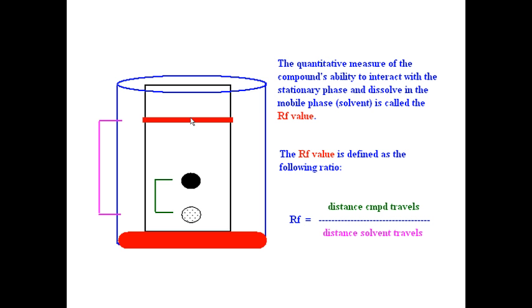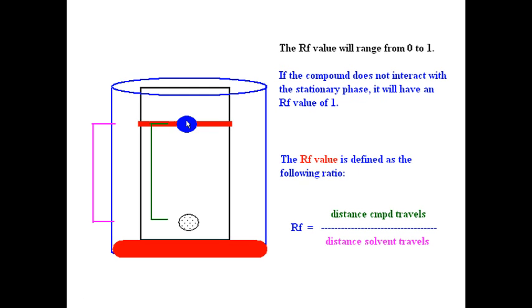And we make all of our markings on TLC plates in pencil. Because if you use pen, the inks will chromatograph just like the spots of our sample, and so we don't want to contaminate it. So we always use pencil to make our markings. So that's the RF value, the distance that the spot traveled over the total distance that the solvent traveled. And that's going to be a ratio between 0 and 1.